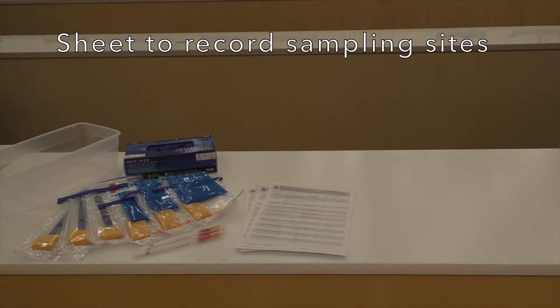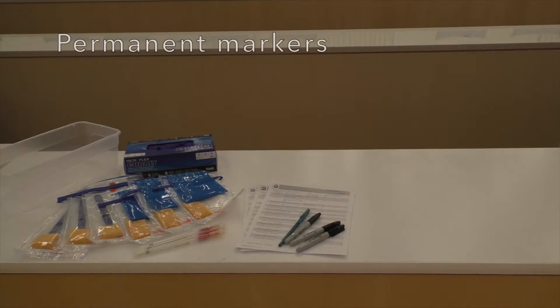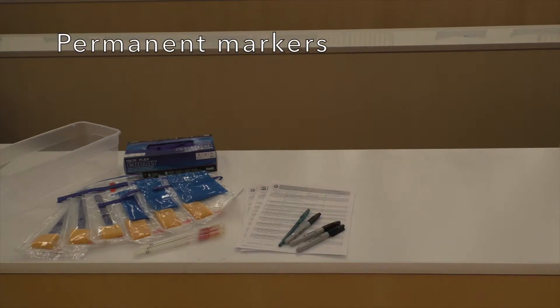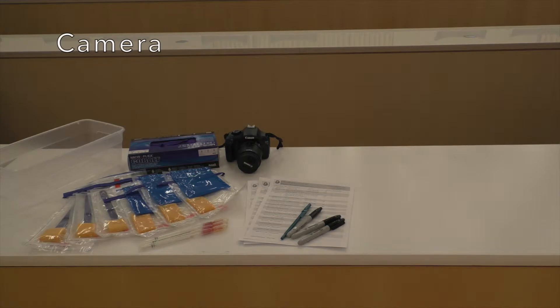Sheet to record sampling sites, permanent markers to label sample bags, camera to take pictures of sampling sites.